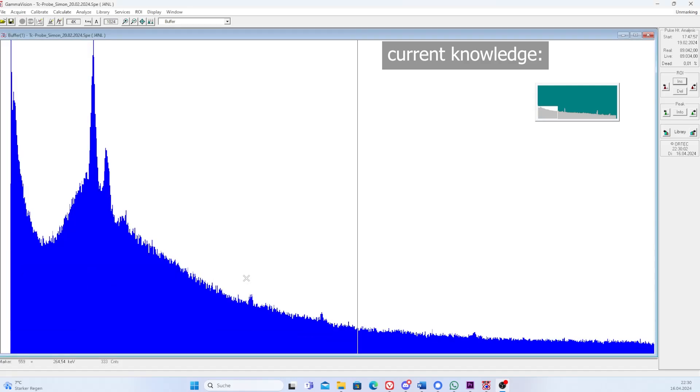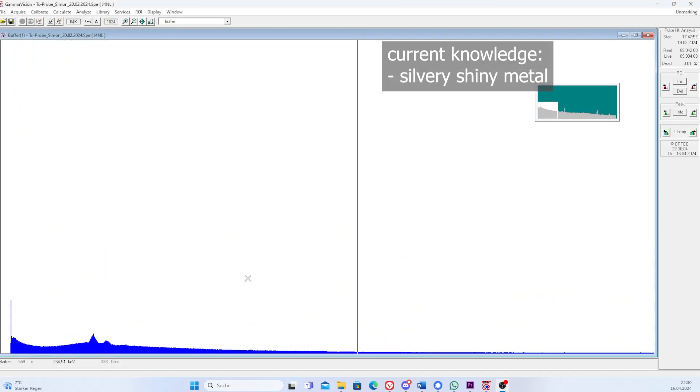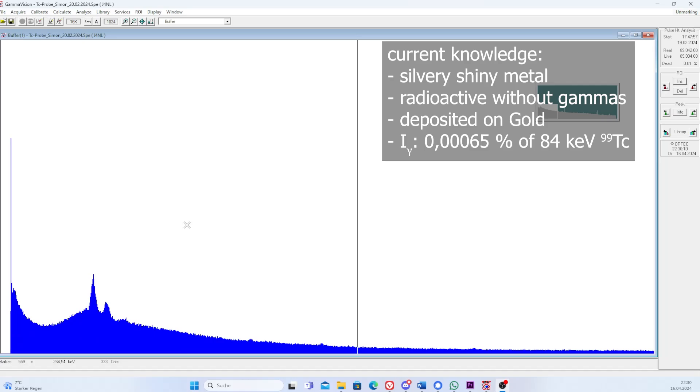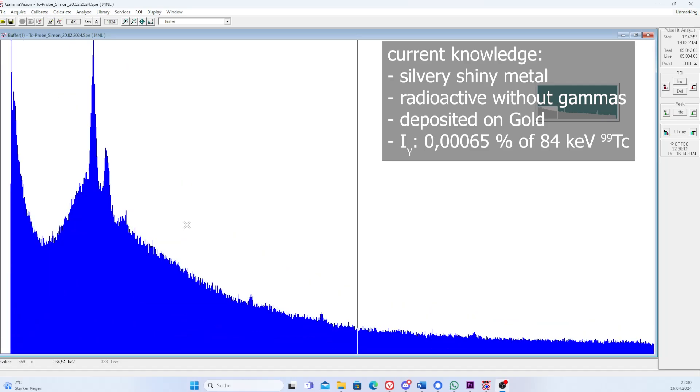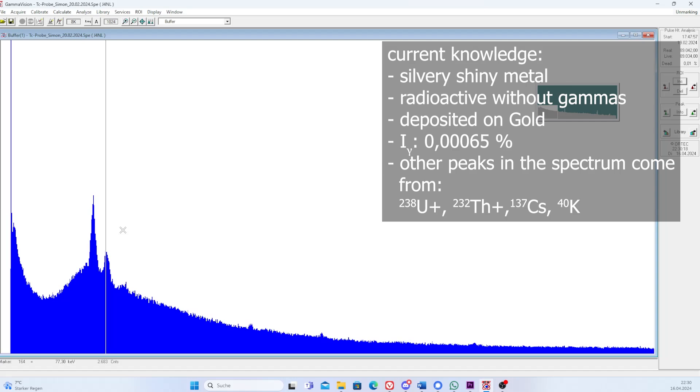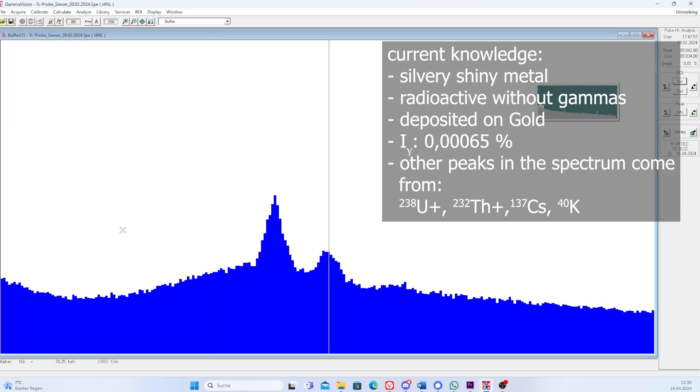And judging by the remaining gamma spectrum, it must only be technetium. Since we have a very shiny silvery metal, and it's radioactive, but it doesn't show any gamma lines. Sure, technetium has a 84 keV gamma line, but with an occurrence probability of 0.00065%, we can just barely see it if we measure gram amounts. And if that were to be uranium, thorium, or neptunium, or something else like that, we would have already seen lines with a relatively low occurrence probability. I measured for good 24 hours, but that's not good enough for me.